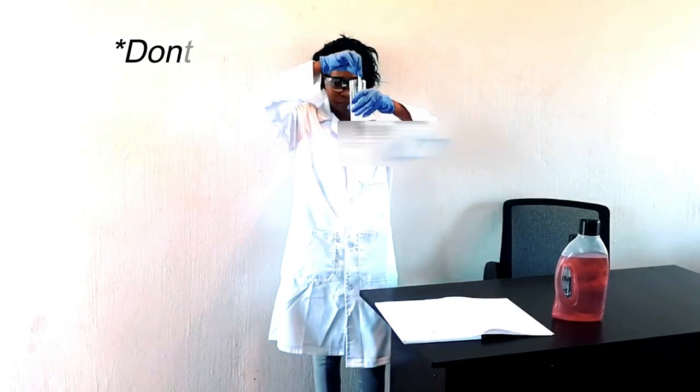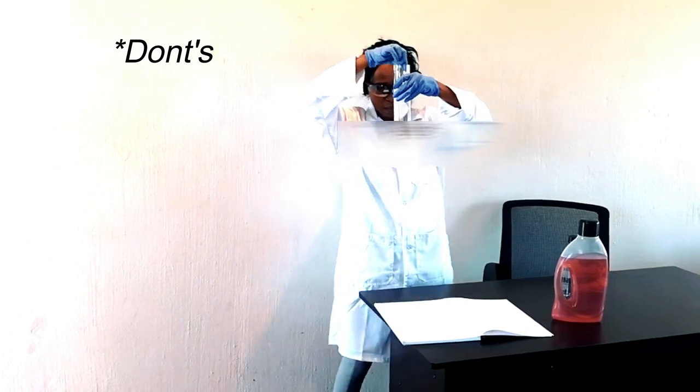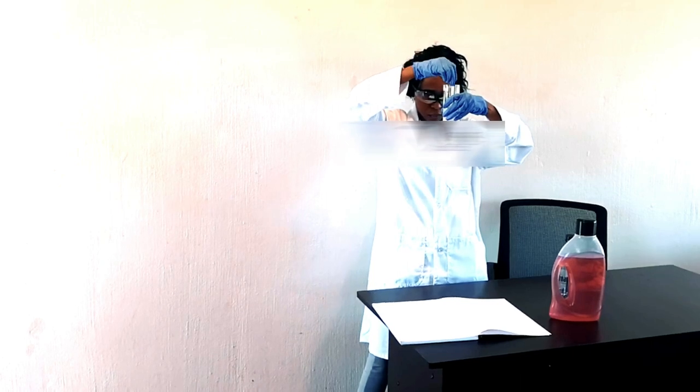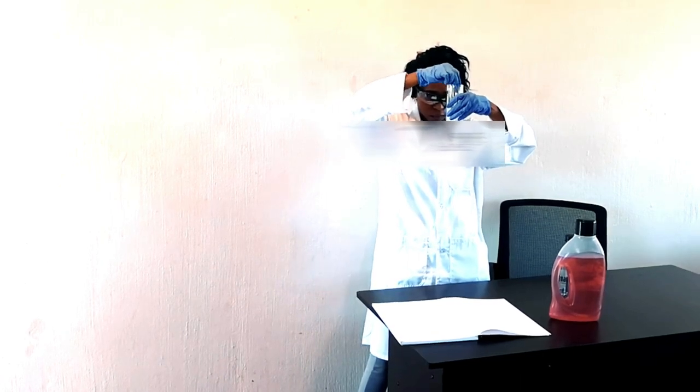Another mistake that people do is deliberately ignoring the emergency alarm. They think, oh well, it's probably just another fire drill and I don't really have to vacate the building. But this is one of the most dangerous and selfish decisions that anyone could do. Not only does it put you at risk, but it puts other people, such as your safety officers, at risk.